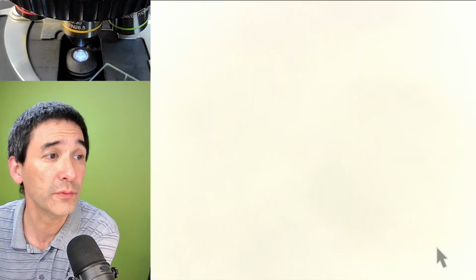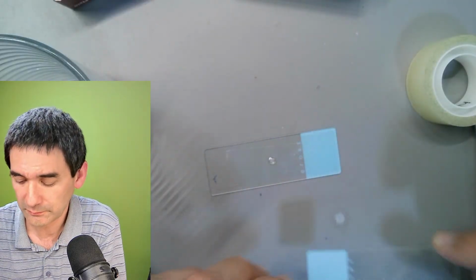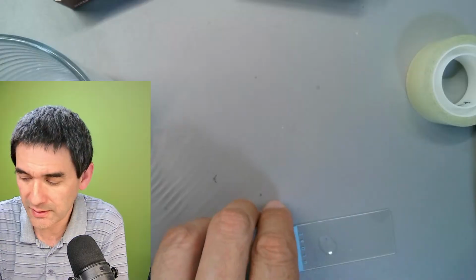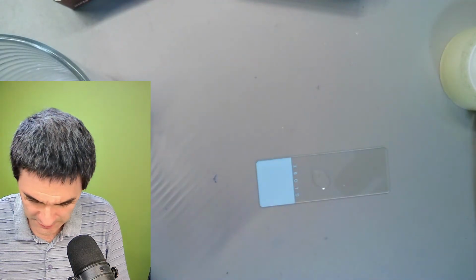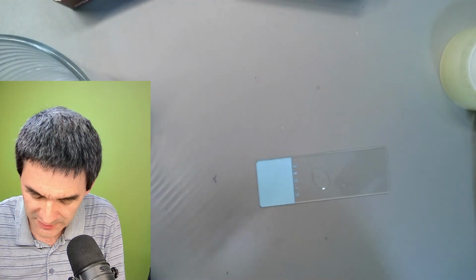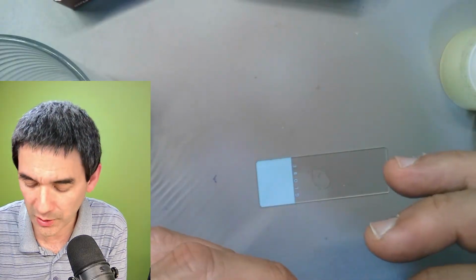Okay, so let's take it off, and desk view. It was not quite successful with the dead ones, and let's see if I have a cover glass. Let's see if there's enough, not too much oil, not too little oil. Of course, there's always a little bit of danger when I add a cover glass that everything spreads, and then there is the possibility that you won't find it where it was before.